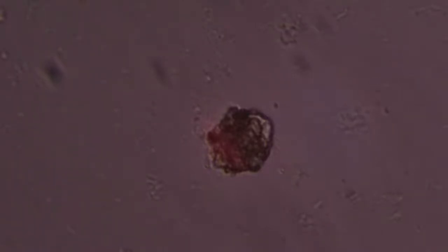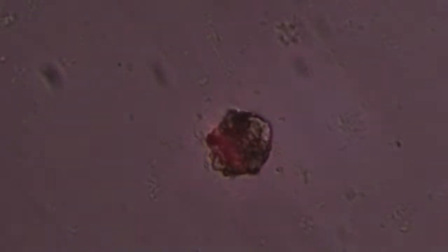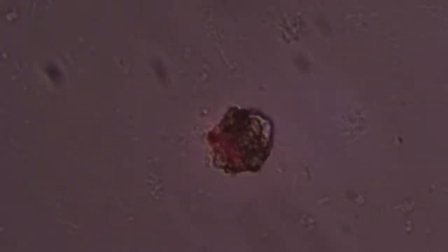Of course, a lot of stuff can be done in Photoshop or something, but it's kind of nice to have it live where you can completely control the view and how much color you get and how much contrast you get. It's different than post-processing. You can see a couple little bacterial dots dance around that big clump of junk.